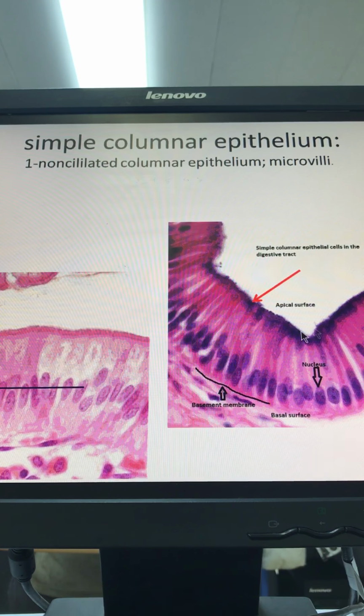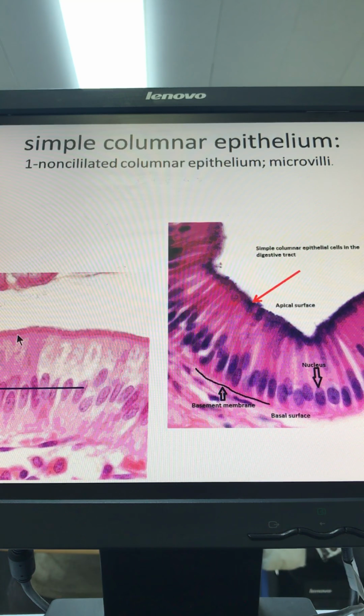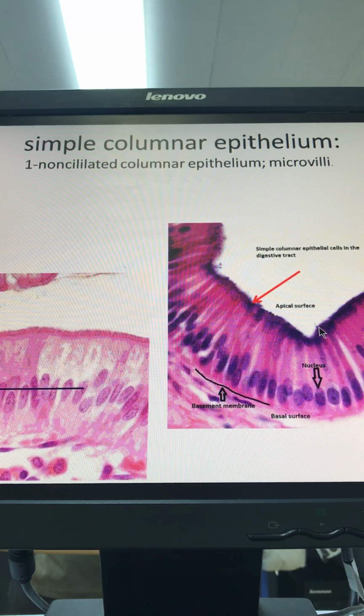Now I can see no cilia. Instead, here at the surface, I can see the fuzzy appearance we said about in the lecture. These are microvilli actually. Microvilli. We have here the fuzzy appearance. Yes, polysaccharides, as we said. We have polysaccharides, oligosaccharides that are attached to the cell membrane apically here. Then the type of tissue here is simple columnar epithelium. We have microvilli.